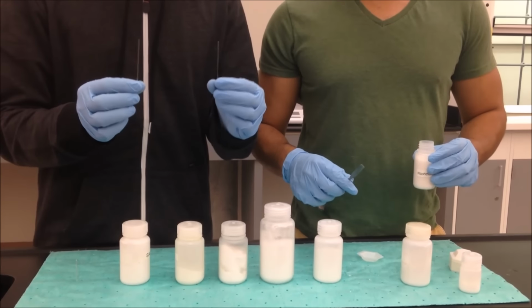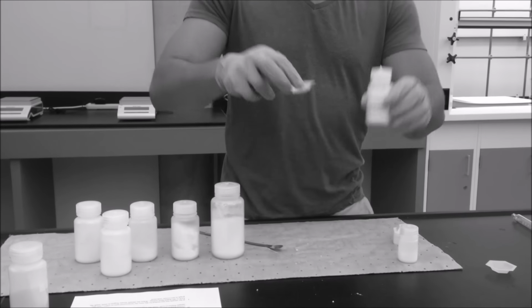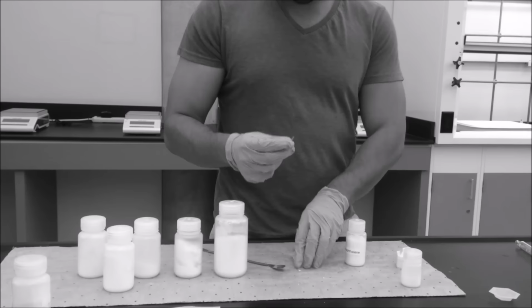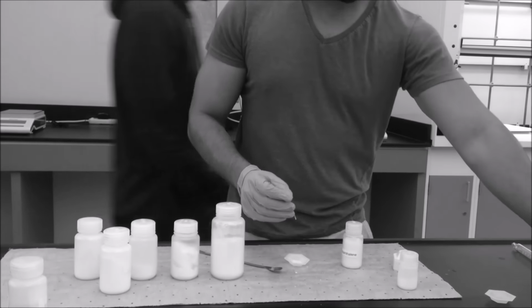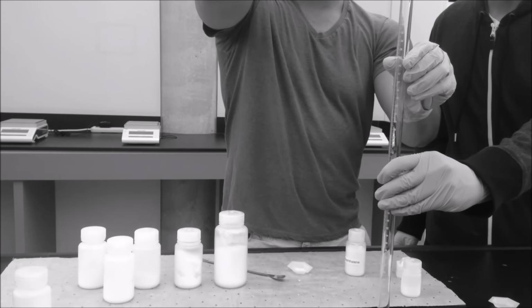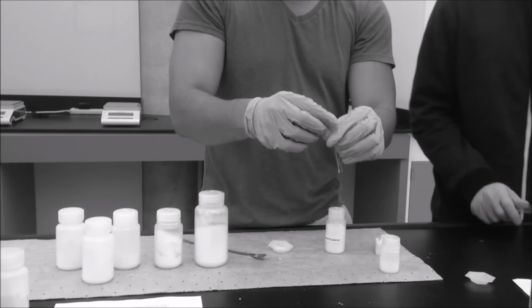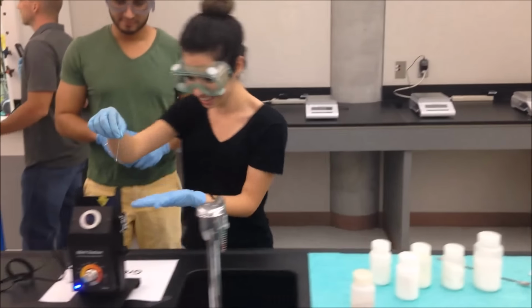Step 1. Obtain 2 open-ended capillary tubes. Place 1 to 2 mm of naphthalene into a capillary tube. Place the tube into the slot in the heating block of the melt station.